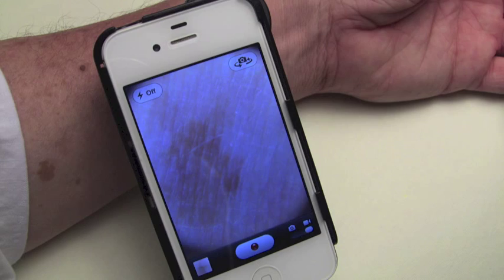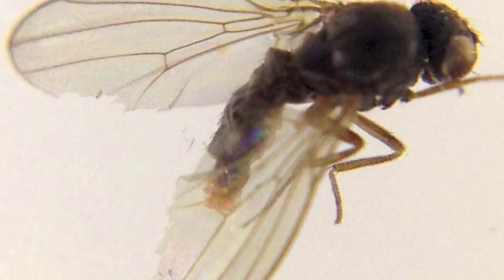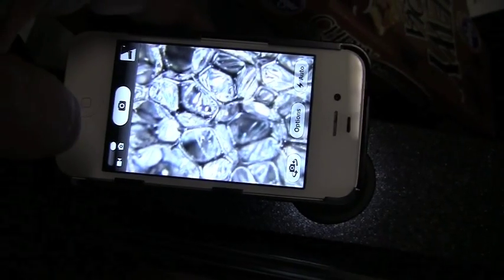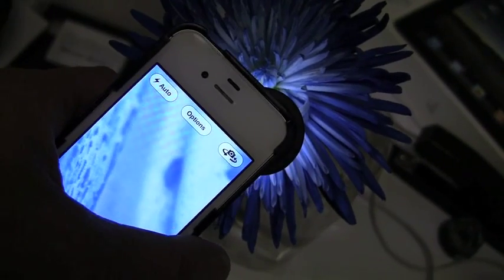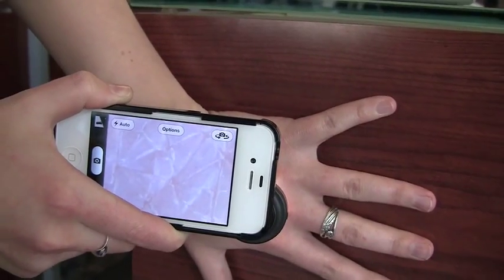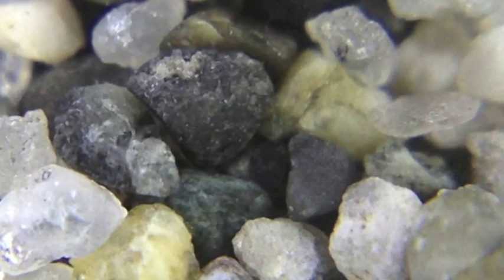The distance relation between the two is within just microns to produce a sharp image with perfect color reproduction. This exacting quality and magnification mean that the focal distance is directly at the end of the lens cone. So you would contact the lens cone to the subject that you want to view. This not only makes the focal distance precise, but it's also designed to steady your iOS device for the super sharp image your iOS camera can produce.